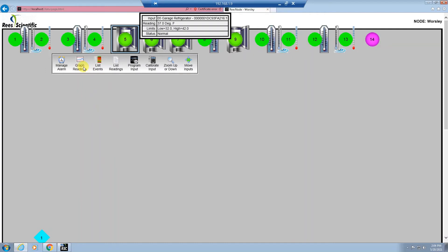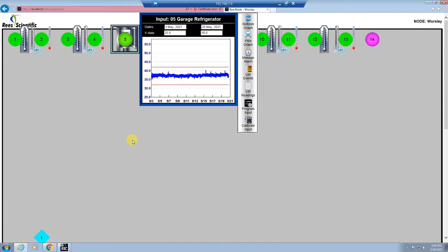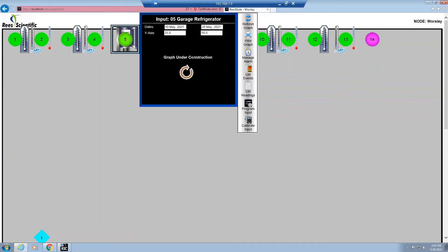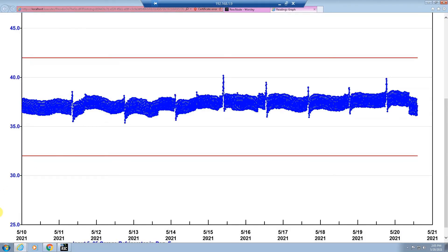Selecting the graph readings icon will display a dialog window with a 7-day graph. The two red lines will indicate the low limit and the high limit for this input along with the readings on the screen. If you would like to change the date range or the x or y-axis, you can select it and hit refresh graph, and the refreshed graph with your parameters will be displayed. To print this graph, select print graph and the graph will open up in a new window. You can select either file and print or Control+P, and you can either print to a printer or as a PDF.